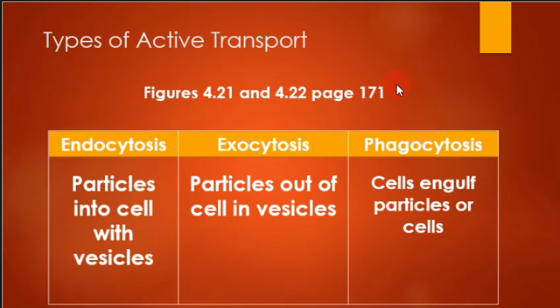Yours is looking really good over here, you two. And Riley, yours is a little slower. Kai, yours is doing all right? Looks pretty good, yeah.